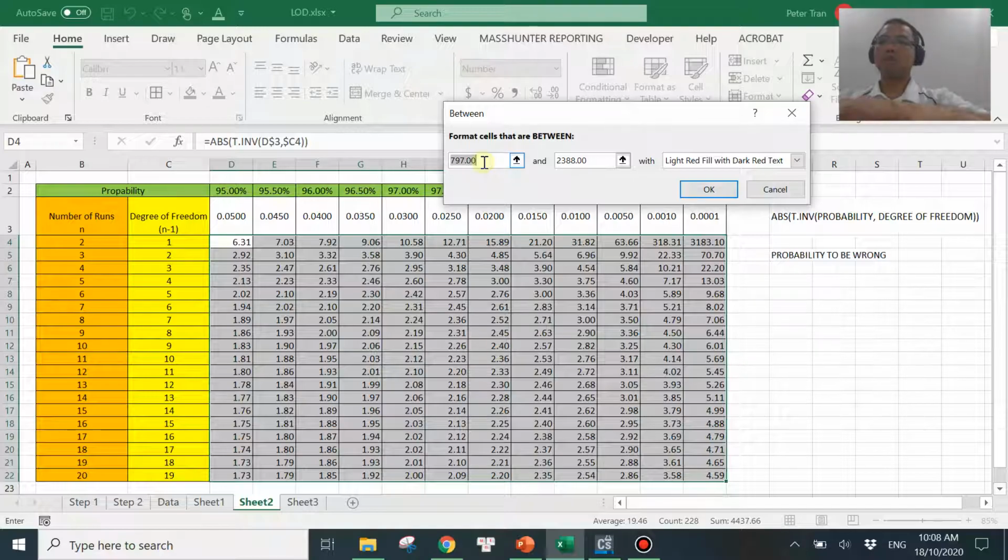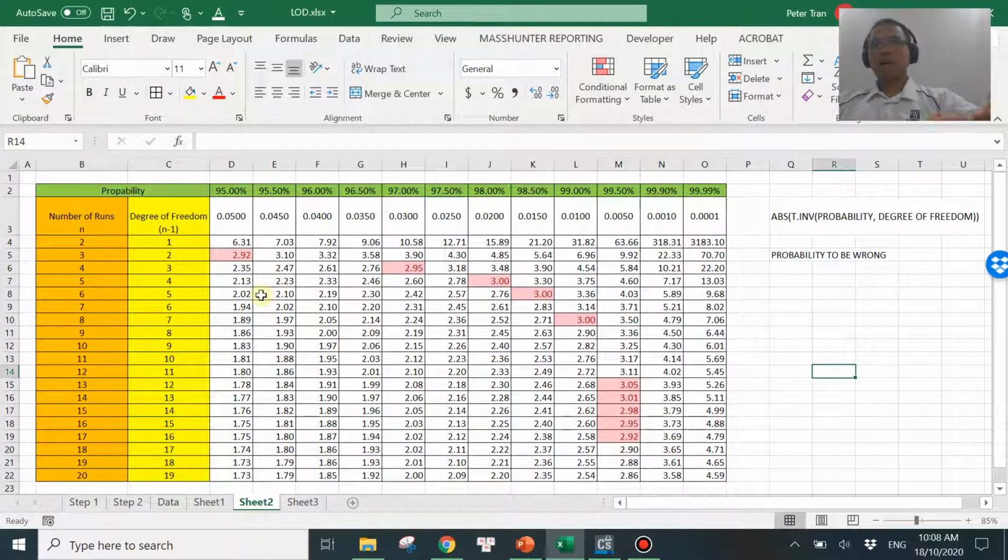So you want to give yourself some kind of up and down a little bit. So I would go from 2.9 all the way to 3.1. That should be close enough to number 3. Okay, there you go. So you have a couple of cases that you can run to get this number 3. So either 3 runs with 95% confidence level, or 4 runs with 97% or something like this over here. So in this video, I'm going to use this 99% and 8 runs, right?